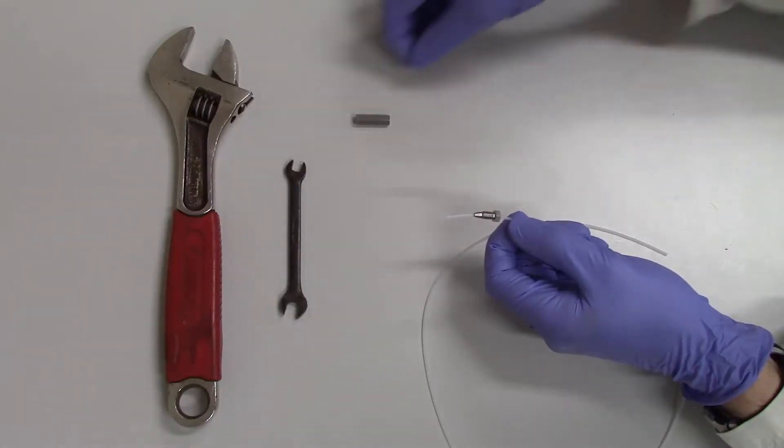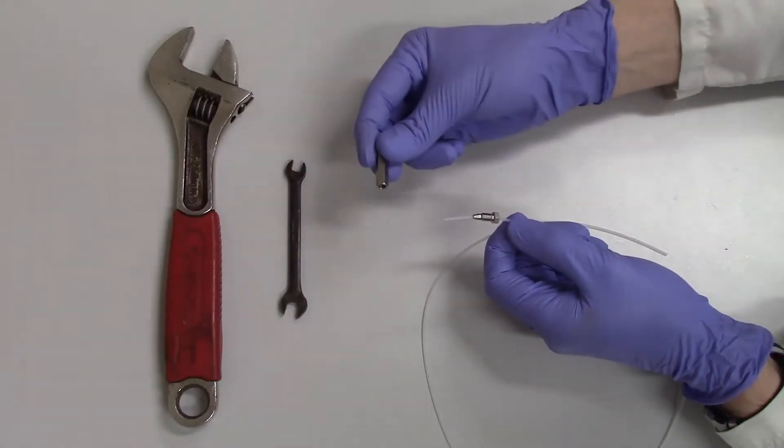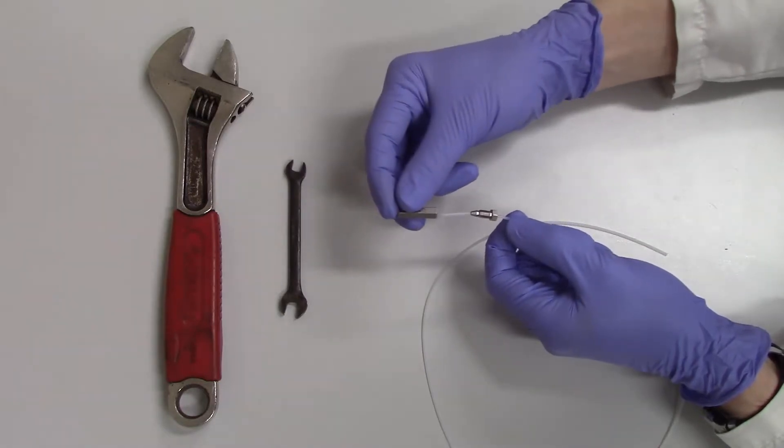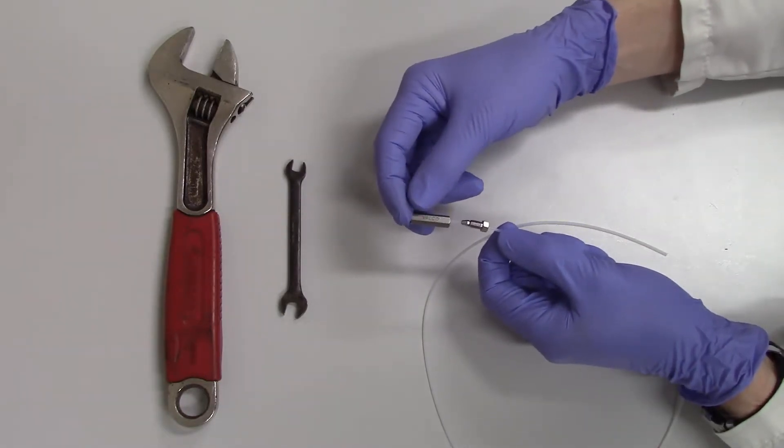Third, guide the tubing into the extra connection piece. While applying pressure to keep the tubing in place, push the ferrule and nut into the socket and hand tighten.